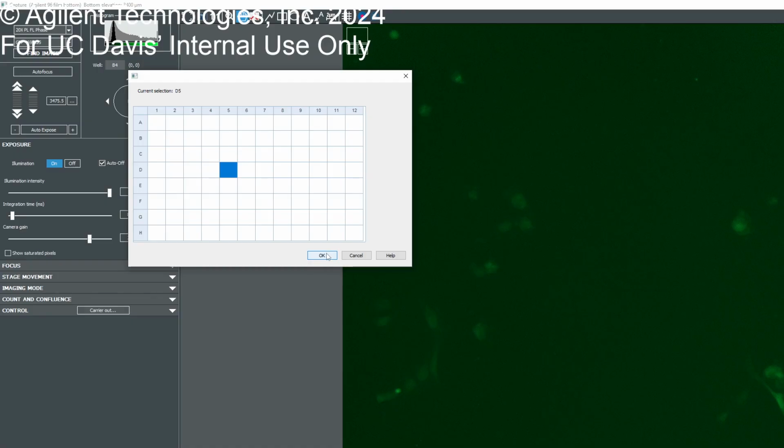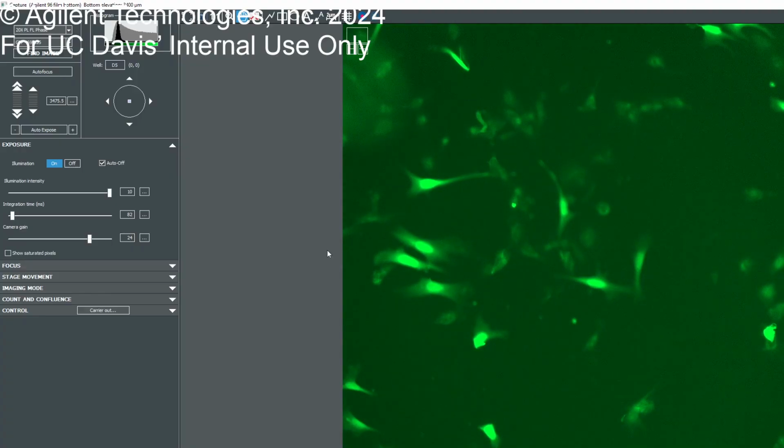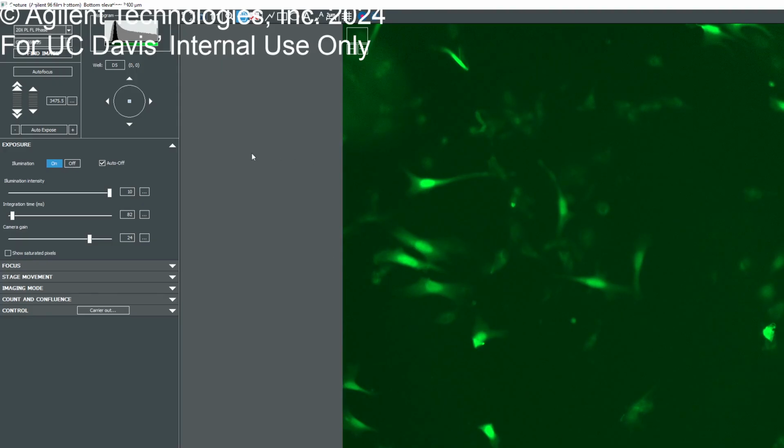I guess taking an average is good to know, because I did set a manual exposure before, and the results were a lot more variable than when I did my method. But like you said, just taking an average anyways. I assumed it was looking at one well, auto-exposing from there and applying that only to that one well, as opposed to taking an average. Makes sense. No, it's going to use the same exposure for the whole plate because of a high throughput screen and stuff like that. That makes sense. Yeah, that's a great point.